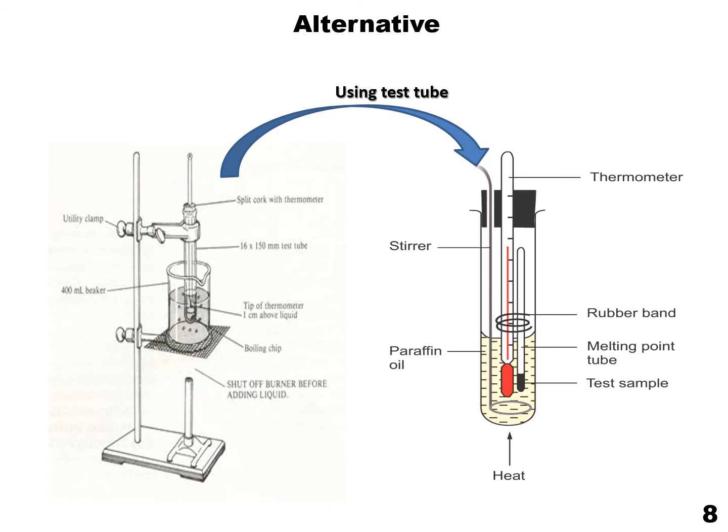Nowadays, all labs have this modern melting point apparatus, but because this melting point experiment has been done for so long, it's not that crucial to use the digital melting point apparatus. You can also do it in a test tube tied inside a beaker.